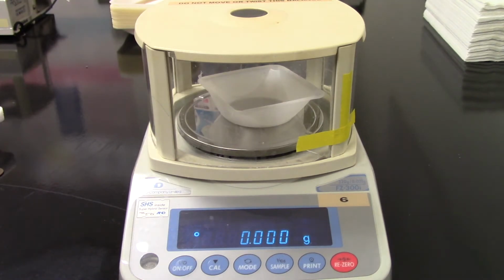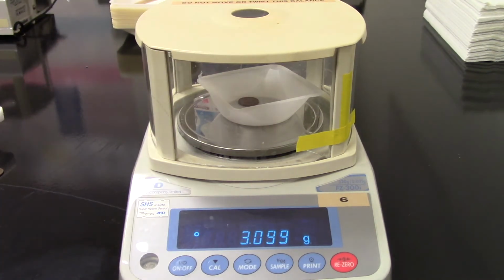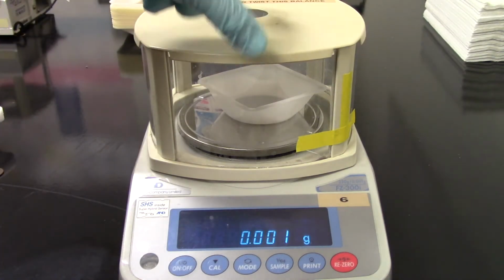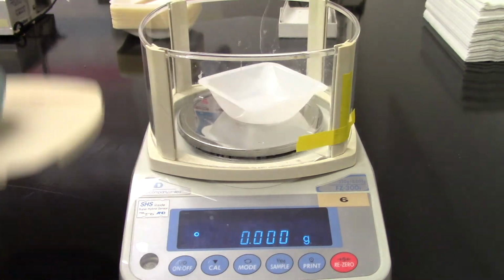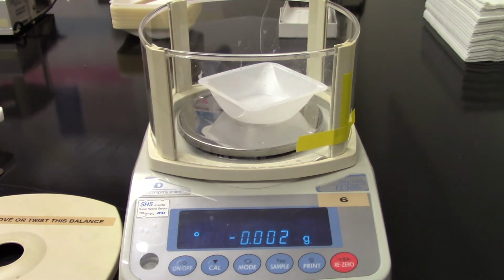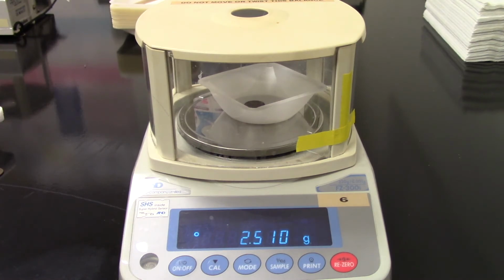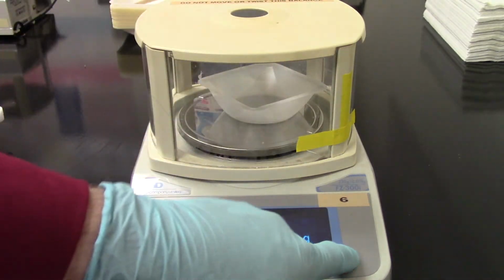This penny is 1980. Make sure you write down all the numbers, guys. Don't neglect them. They're all important. The next one that's coming is 1982. Oh, wait, no, sorry. It's 1988. One second. I can't read this penny very well. Yeah, 88. There we go. Make sure you write down all the digits from the scales, guys. Don't neglect any of the digits. They're all important.